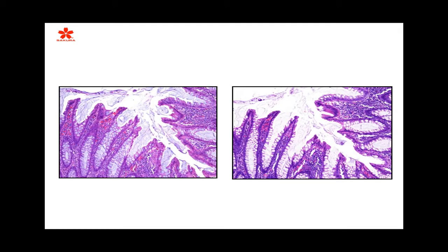This next set of slides that I'm showing you, my laptop shows one thing, but the projector shows something different, so I don't really know what you all are seeing in the audience. The slide on the left is a section of colon that was stained. If you can see very closely, you could see the goblet cells here, with a slight tint of hematoxylin dye in them.